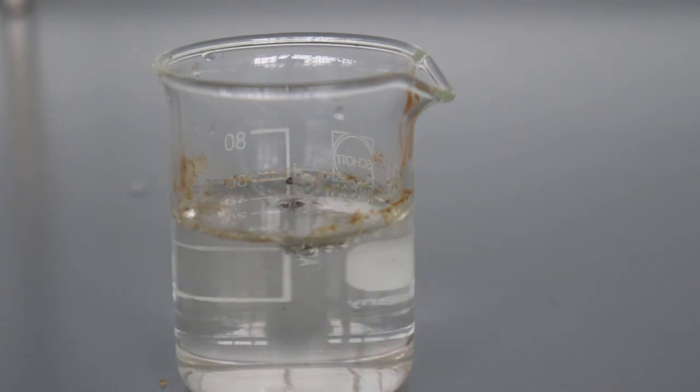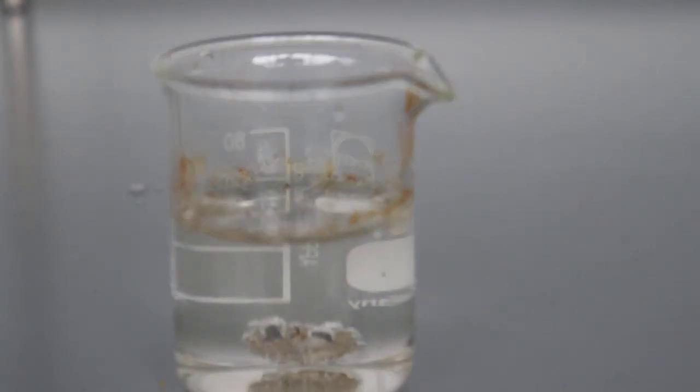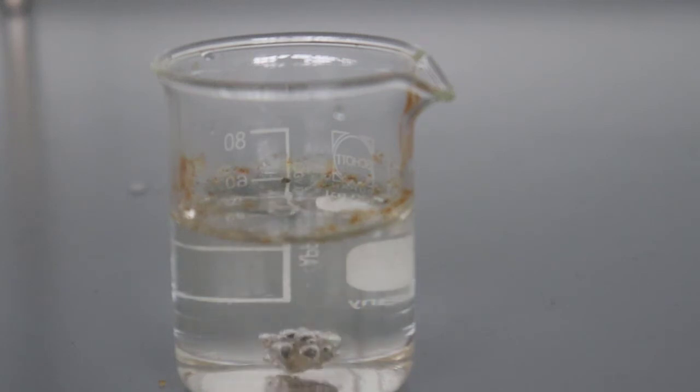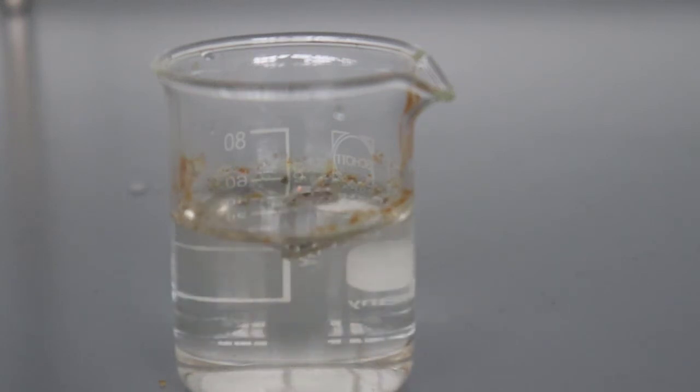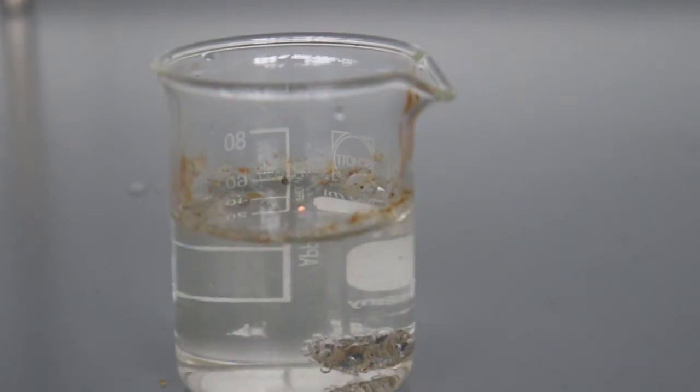It is easy to start, and the methane reaction gives out just as much heat, but it is not as easy to start. Both of them run away on their own if they're mixed, and so if you mix methane with air it can explode, and if you mix silane with air it explodes on its own, which is why you normally make it to demonstrate this, which is what I'm doing here. It's a reaction of magnesium silicide and water which generates silane.